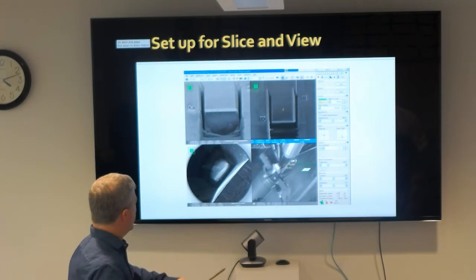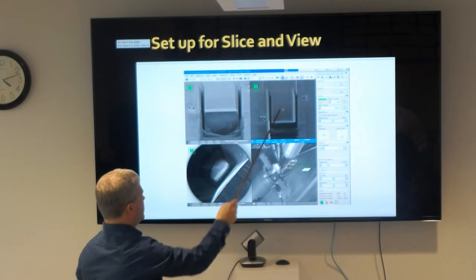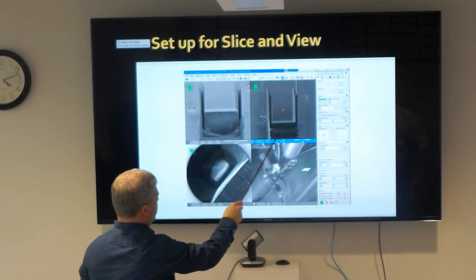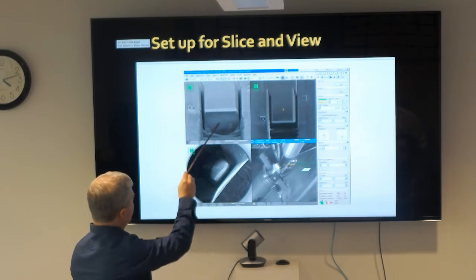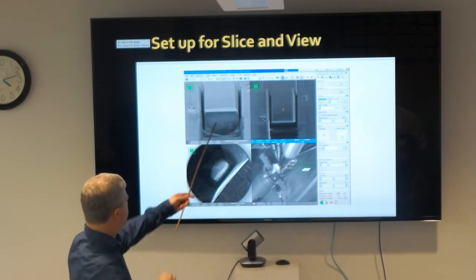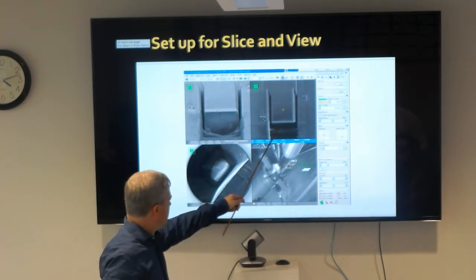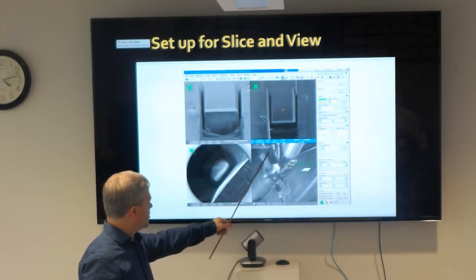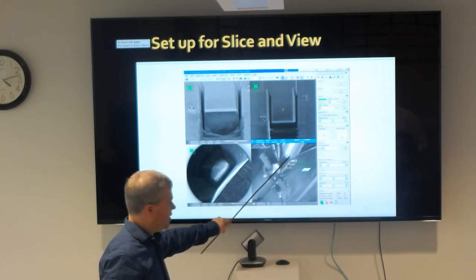And so in the microscope, this is how it looks. This is an area that's been protected, it's been coated with platinum. A trench has been dug ahead of it, and then there are side trenches. And this is looking at the same area with the electron beam. So with the electron beam, you're viewing it at an oblique angle, so you can see this face of it that's been produced. So this is looking at this face here at an angle, and this is how it looks inside the microscope. This is the sample. This is the electron beam, and then this is the ion beam coming at an angle.